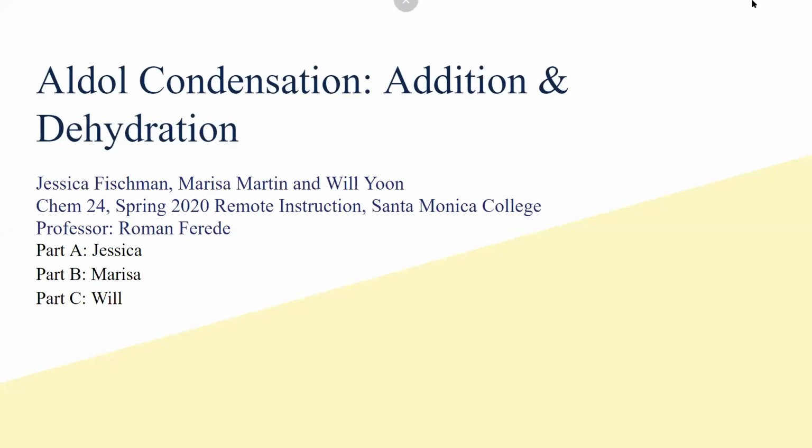Okay, so for this video, we will be discussing the aldol condensation and addition and dehydration. I will be doing part A, Marissa will be doing part B, and will be doing part C.